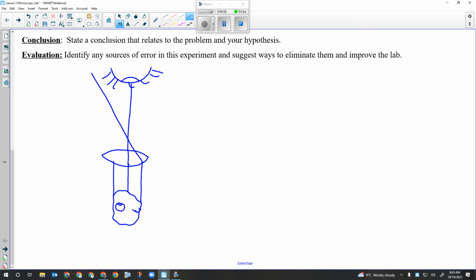And then the light that hit this side goes over here. Now what that leads to is this divergence of the light. So the light that came from this side of the specimen ends up over here. And now, I shouldn't have drawn that eye.